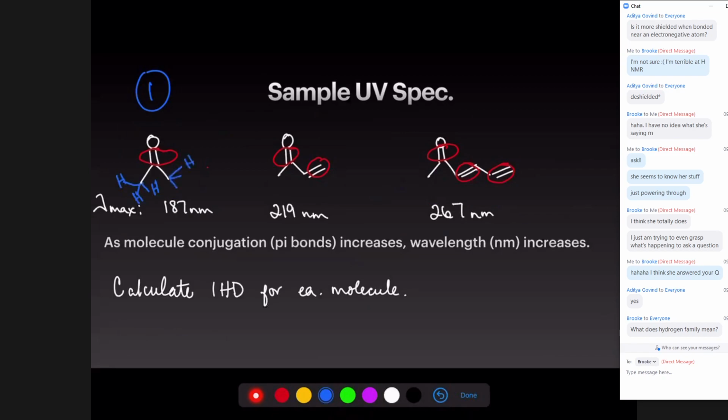It's just a group of hydrogens on the molecule. So here's a family, and here's a family. And same thing on this molecule. You have 3 hydrogens here at the end of this carbon, and you have 1 here, and you have 2 here. So this is a hydrogen family. That's a family of itself, and that's a family. And I got them all. Does that make sense?